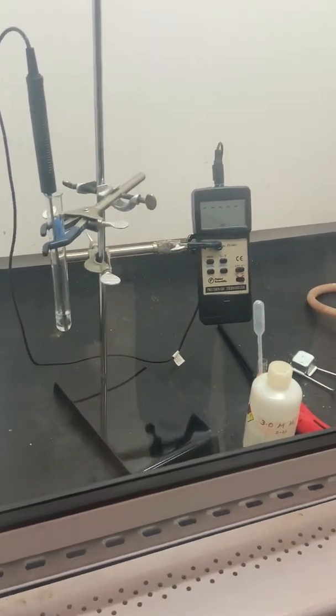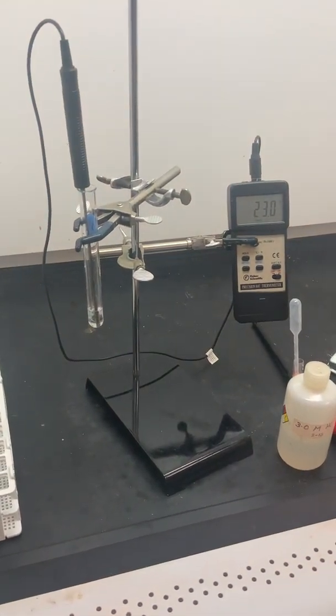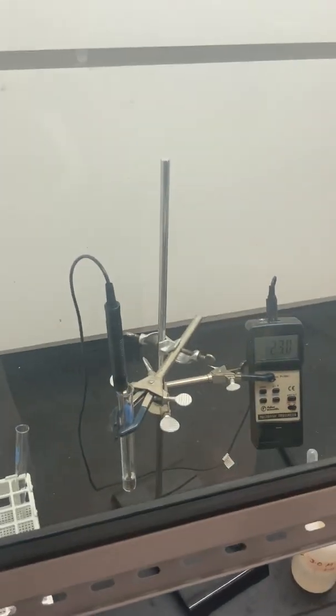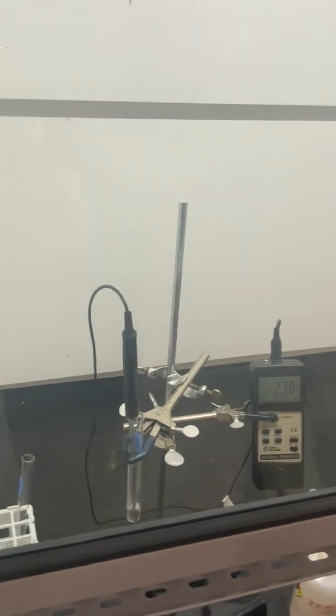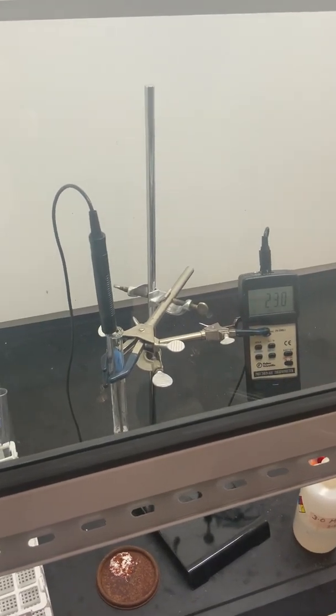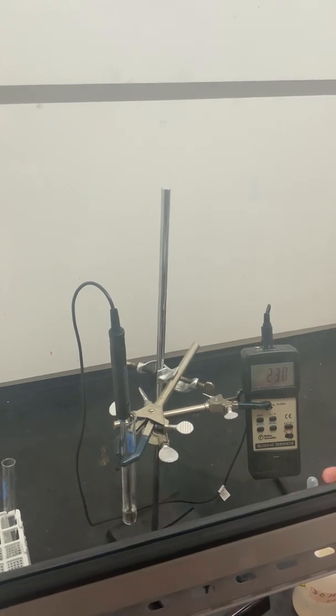Here the thermometer probe is put into the hydrochloric acid, reading about 23 degrees Celsius. And then what I'm going to do is put in a little bit of magnesium. This magnesium has been ground up really fine, another thing we can do to accelerate the rate of chemical reaction.